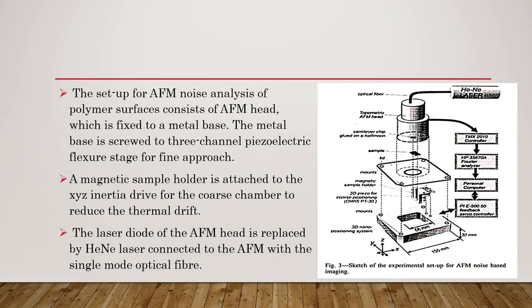For example, the setup for AFM noise analysis of polymer surfaces consists of an AFM head, which is fixed to a metal base. The metal base is screwed to a 3-channel piezoelectric flexure stage for fine approach. The piezo stage has active feedback control with sensors for distance control. A magnetic sample holder is attached to the XYZ inertia drive for the coarse approach. This assembly is fixed to the 3-channel piezo stage. The setup is placed in a closed chamber to reduce the thermal drift.